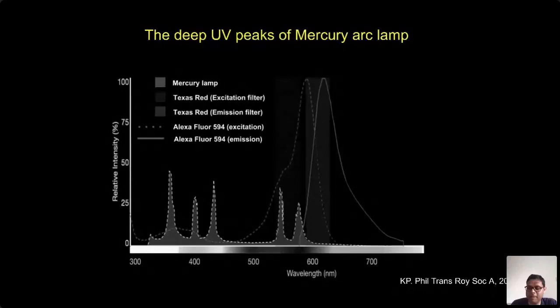This is one of the things I have been working on, and this is one of the protocols for how you can go about it. You have to find the right dye. You have to find the ideal photon count and the structures you want to resolve. You can start with a confocal, do SIM, follow it with a STED, recover STED bleaching, get the single molecules, and then do the whole single molecule work. This is the whole pipeline I have been working on.